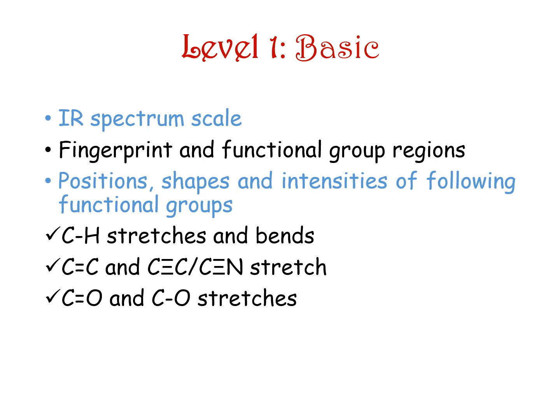C single bond O means hydroxy compounds or ethers. OH and NH stretches, so amines and again hydroxy compounds.